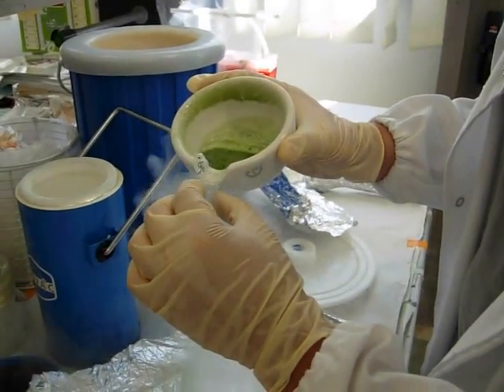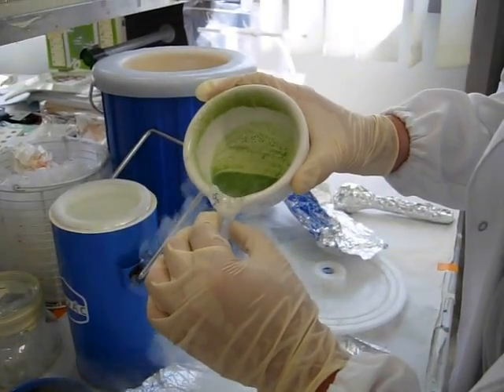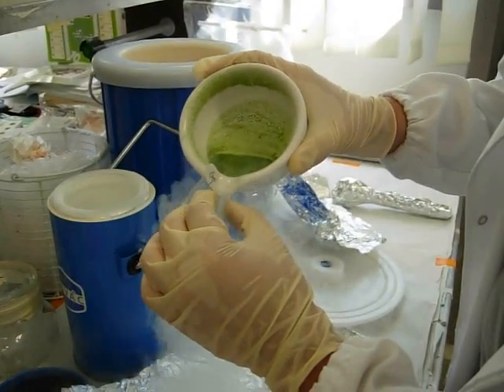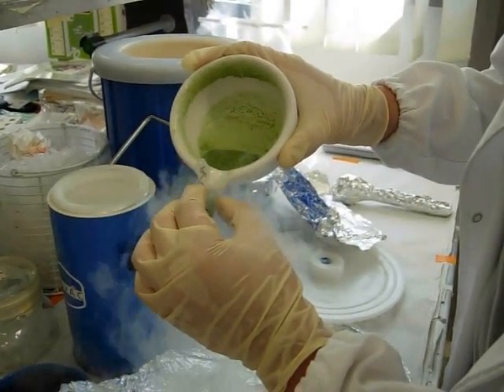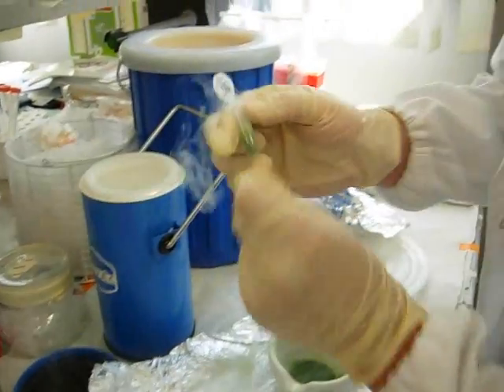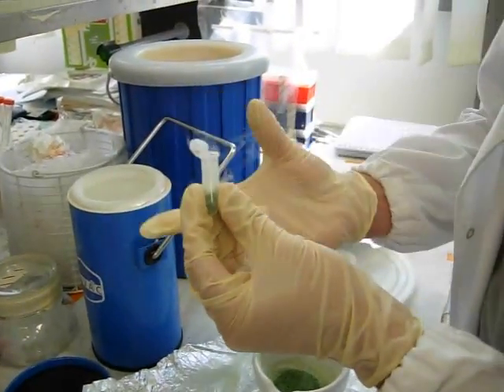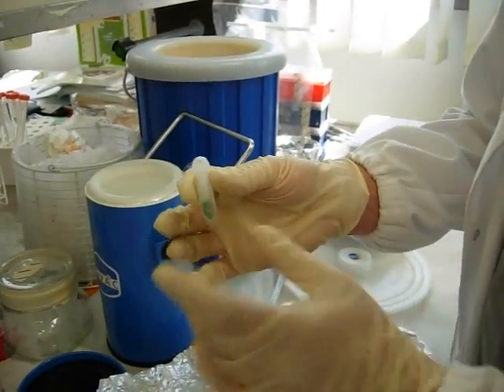I have to wait a bit for the right moment and then I start filling it up. This is the exact amount for the further extraction — about one third.